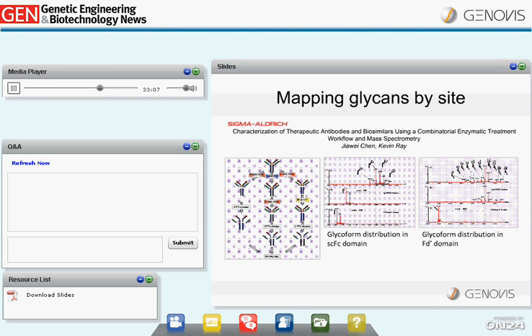Using high-resolution mass spectrometry, glycans present at approximately 1% are usually clearly detected. The size reduction accomplished by the use of the FabRICATOR enzyme, together with the site-specific deglycosylation by IgG0 and the more general deglycosylation using PNGase F, allows for glycan mapping of different sites in the IgG.